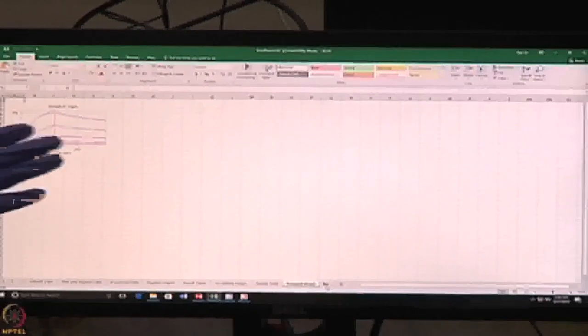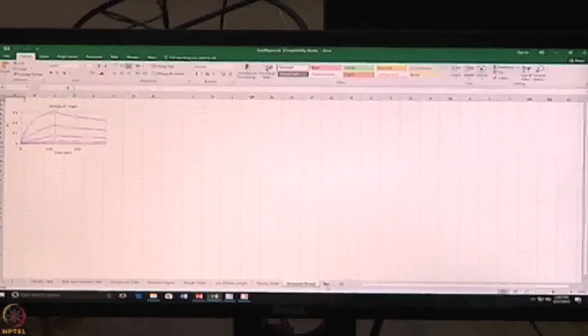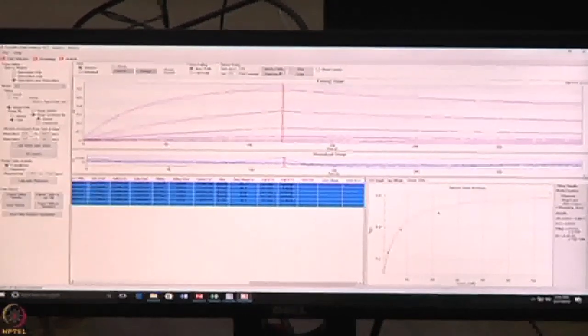And the group view, if you are performing some other kind of presentations, and when you are running different batches, you can get the sensorgrams, those things. So these are the report formats, and the good advantage is that this fitted result you can use in some other software. Say suppose you want to review or analyze this data in the Biacore software, yes, it's possible. Or you want to use a third party software like Scrubber, yes, you can do it using this. Multiple options are there.